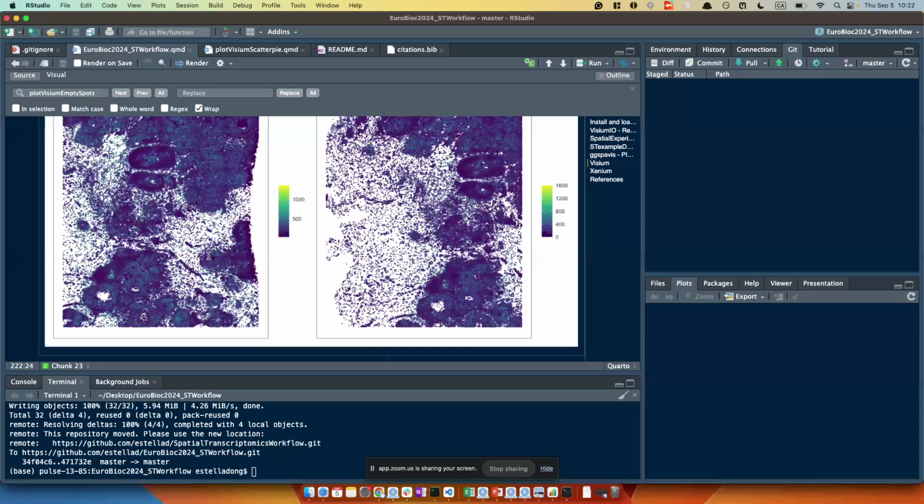Yes. So I'm not sure, because the idea behind this is very simple. You just manually select 3 dots between the 2 images as landmarks, and you align the landmarks. In R, for example, in our lab, we have a Shiny app to do so, but it's only a linear transformation. But if you want to deal with the twisting or the rotation of the image, then I think STAlign has an additional step of correction with nonlinear transformation. So I think this field is a mix. You can't really isolate to Bioconductor only.